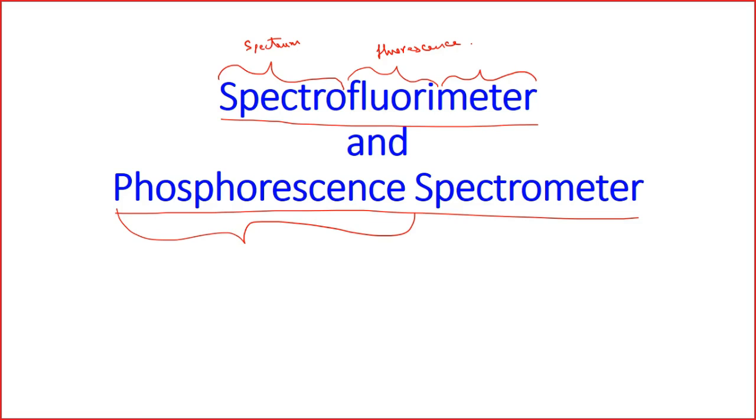The UV is falling onto the DNA samples or the base pairs, and it is giving some fluorescence, and you are measuring that fluorescence. So if you can isolate those, you can find out the concentration of those things in a particular volume. So how much is that base pair and so on. Okay, sir. It is possible.